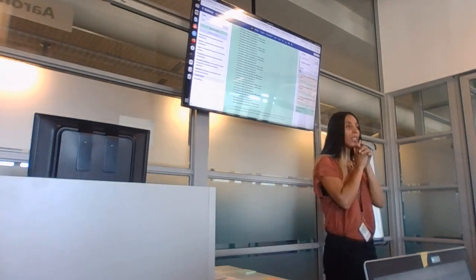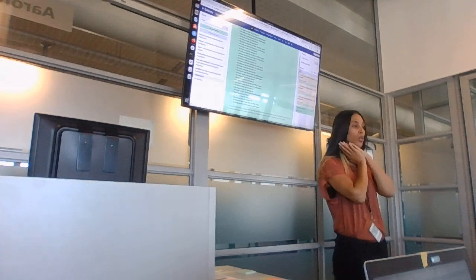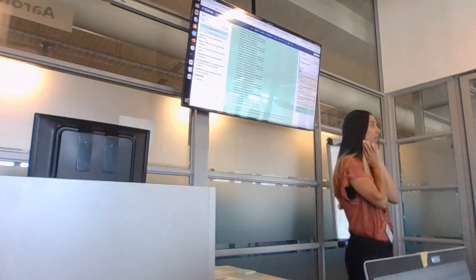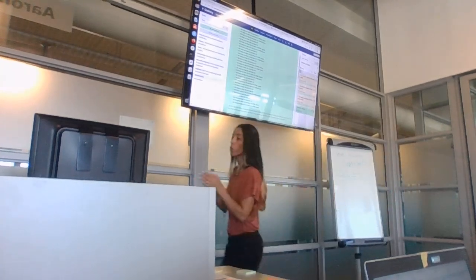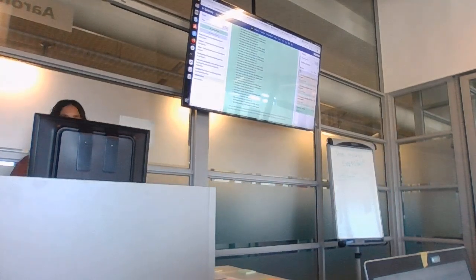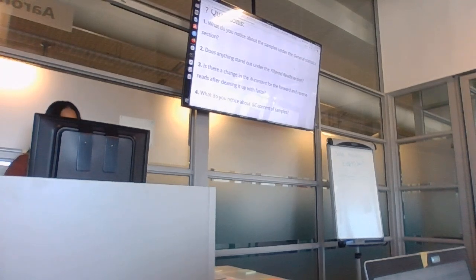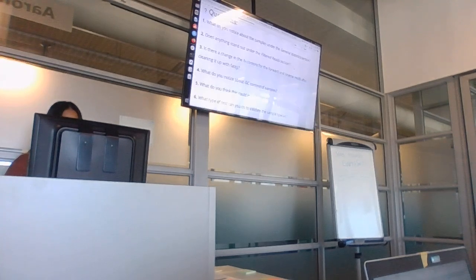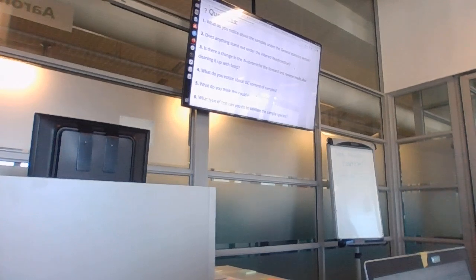Okay, whose FastP is done? I want you to analyze what you see in that file and tell me. There's a set of questions that you need to answer, again on the website. I'll get you now. Answer these questions about your FastP file. Okay.